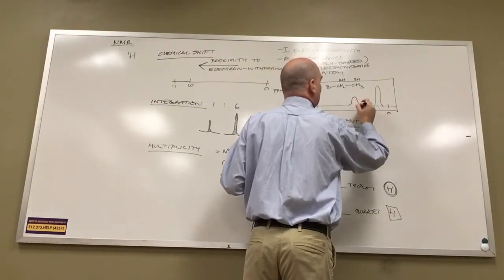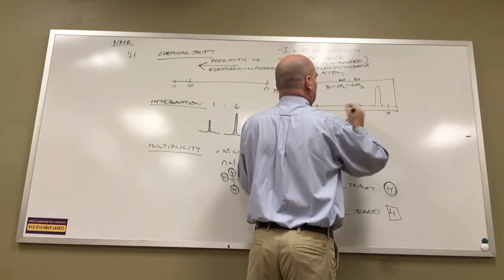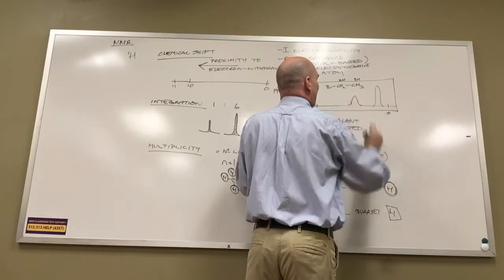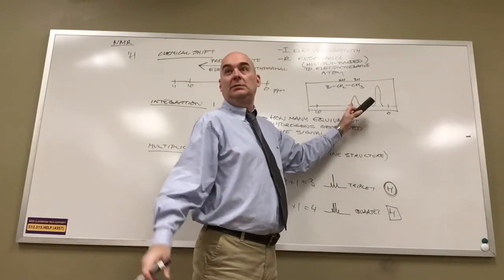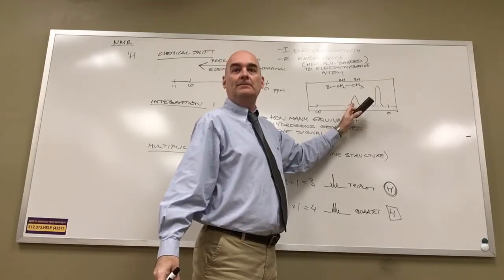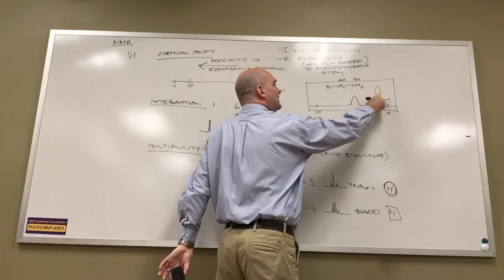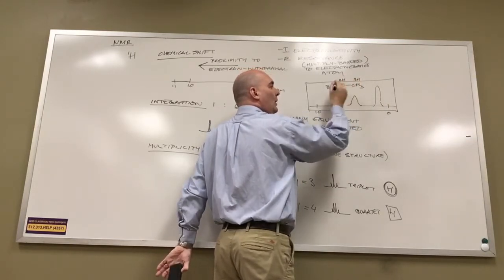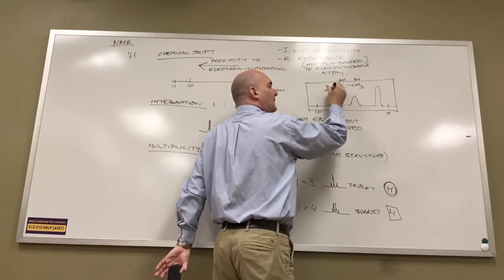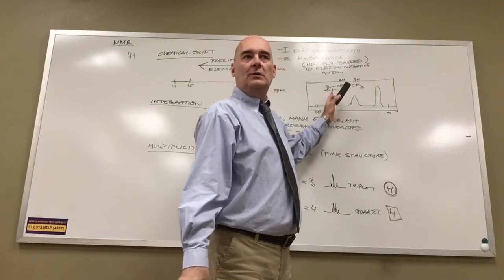Might fill the space under this curve. 3:2 ratio, kind of, sort of. Okay. So I know the size of my signal depends on its integration. I know bromine's in group 7. That's my electron withdrawal.